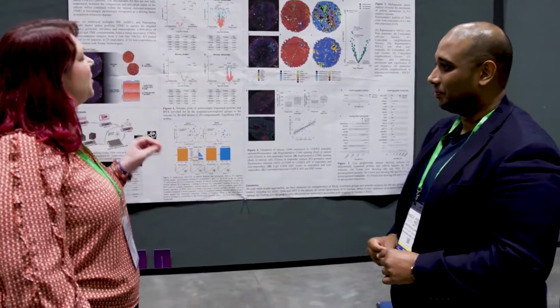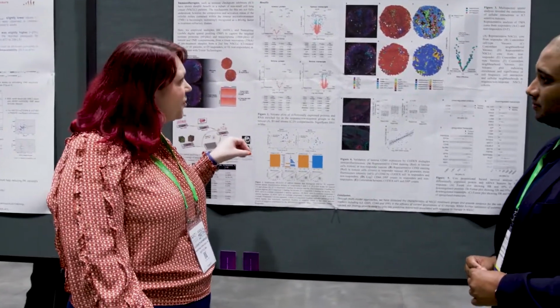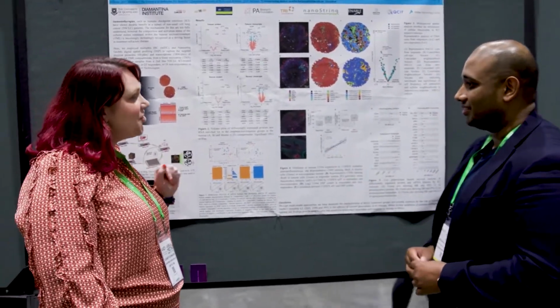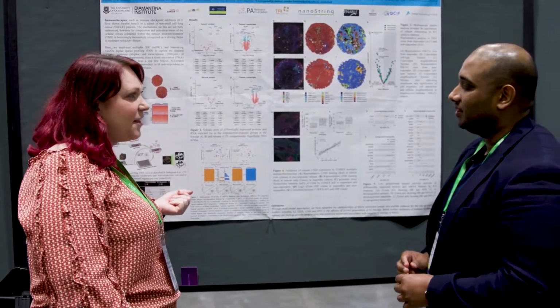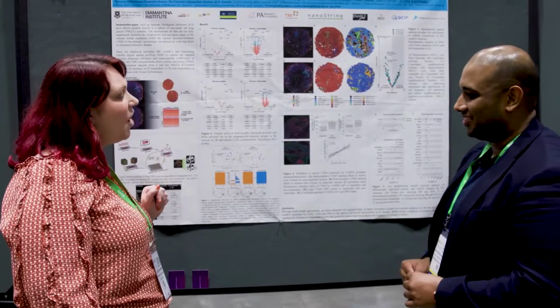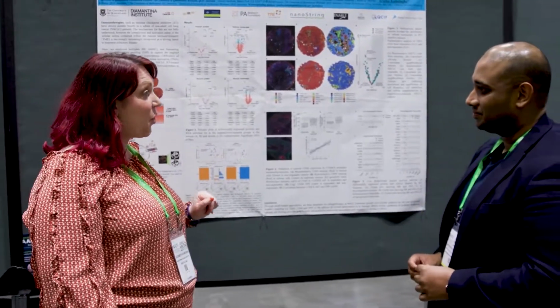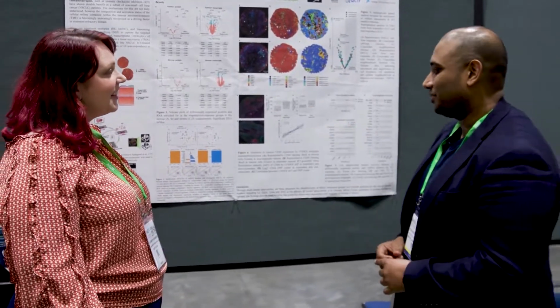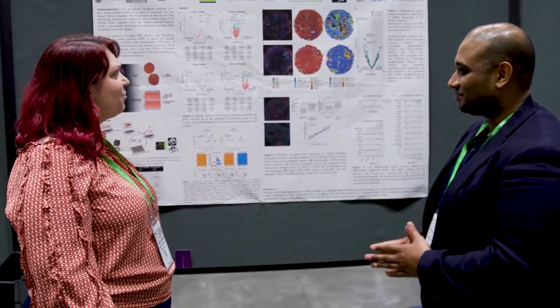I see. And with the responders, did you see the IL-2 in the tumor regions, or did you not? No, it was in the stroma exclusively. Interesting. And did you also find signs of immunosuppression in the non-responders? Yeah, we're working through those at the moment. Okay, great. And you used the CTA for this. Since then, have you used the whole transcriptome? We have. I haven't shown the data here, but we've got whole transcriptome data on the back end of this as well. Excellent. This is really great.